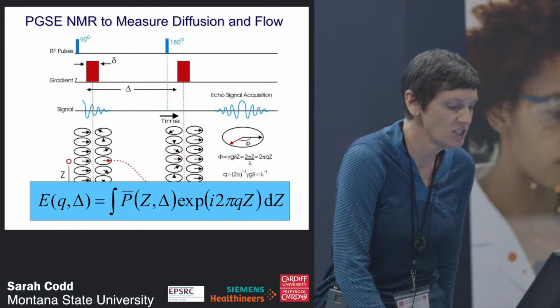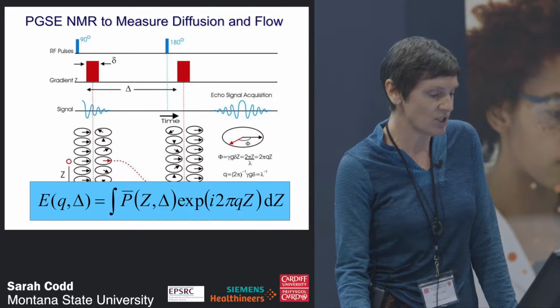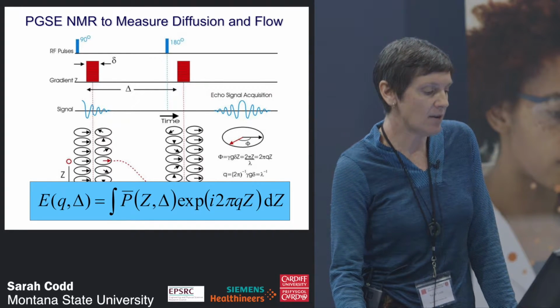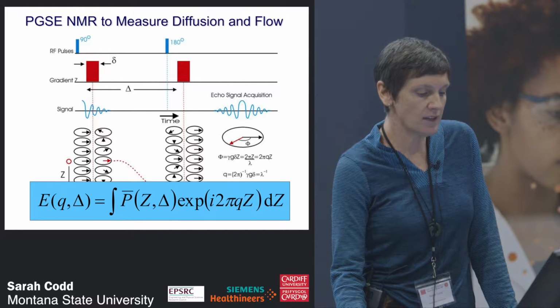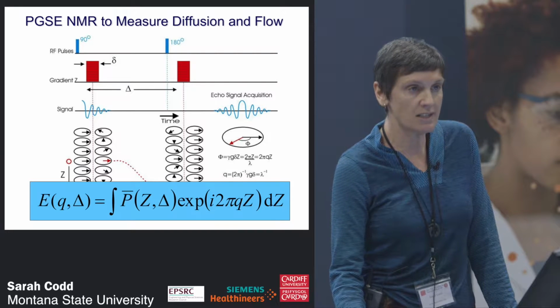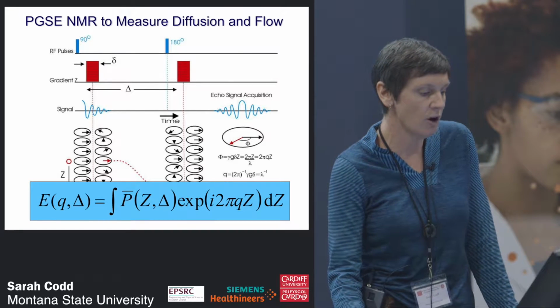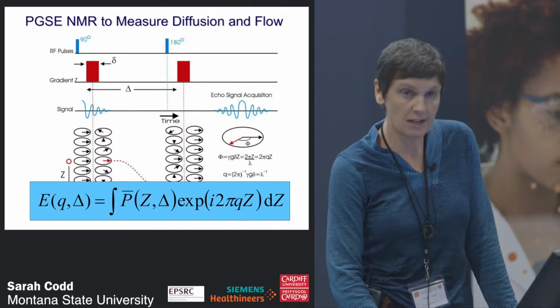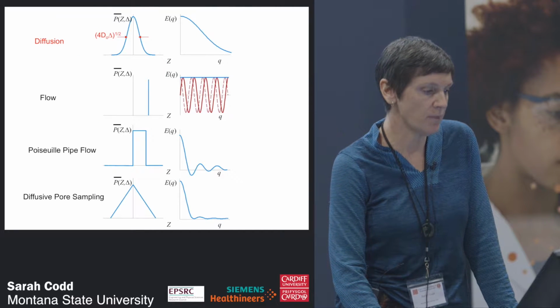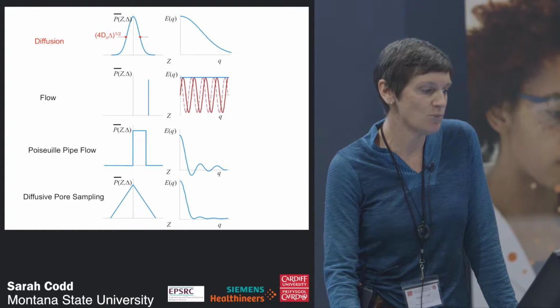So here was the relationship that I became really fascinated with and enjoyed. The idea that the space in which we collect our experimental data, if you think of the combined effects in Q-space, so the area underneath the pair of gradient pulses, then if you can collect enough data, you can Fourier transform it to get an entire representation of the propagator. And so that meant that there were a lot of really great fields in which we could apply this.